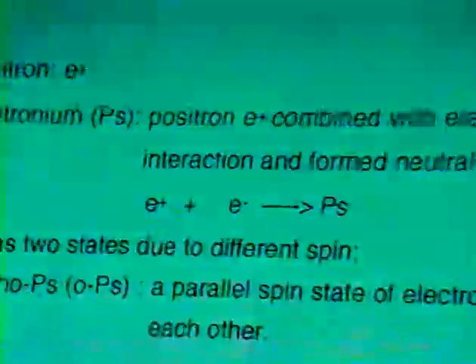Positron annihilation spectroscopy has been known as a new physical probe for studying microporous materials. In contrast to other techniques, positron annihilation spectroscopy probes the free volume properties directly without significant interference from the bulk property. Now we would like to explain about positron. When a positron is injected into the molecular substrate, it interacts through elastic collision processes.